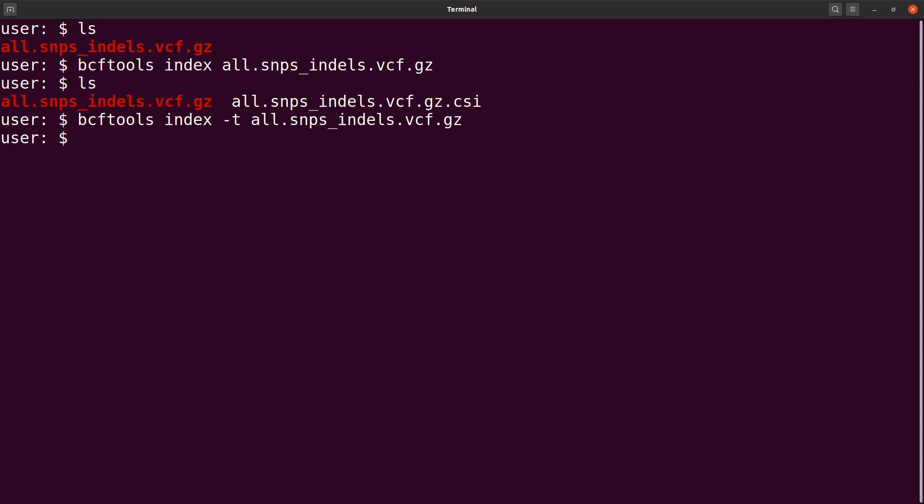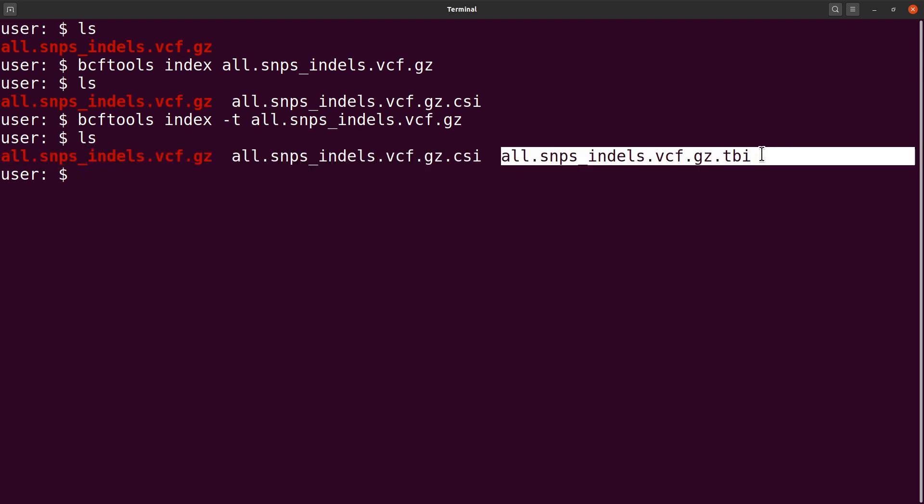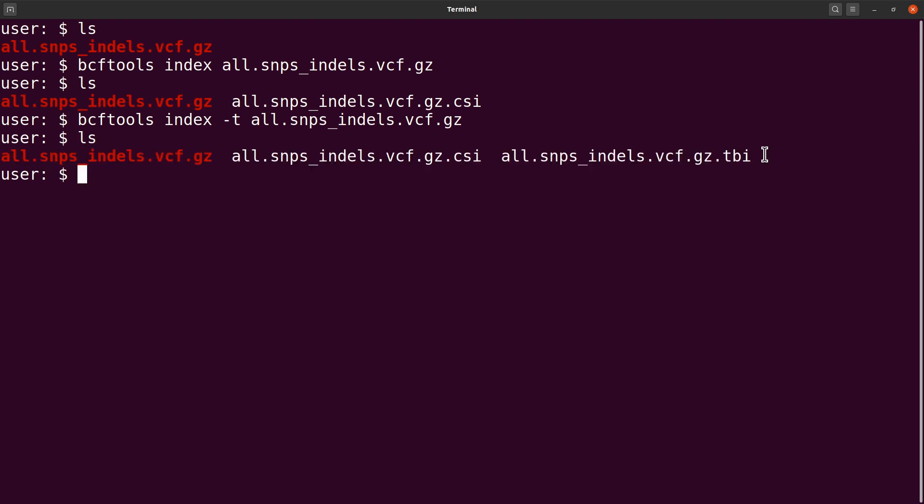We run it and that is also generated. We say ls and you will get it also here. This is the tabix index file. That's how we do it to get the index file.